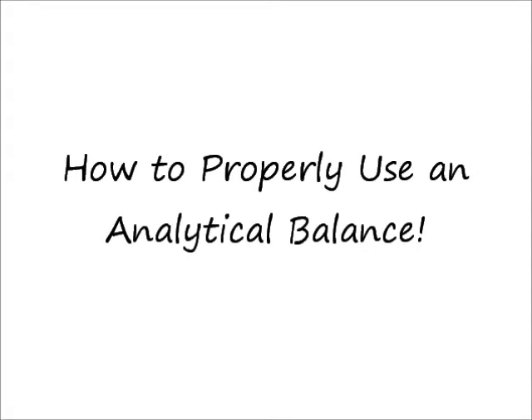In this video, Anna Tyson, Jessica Blair, and Madeline Adams are going to demonstrate how to properly use a balance.